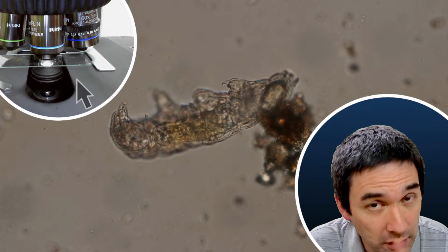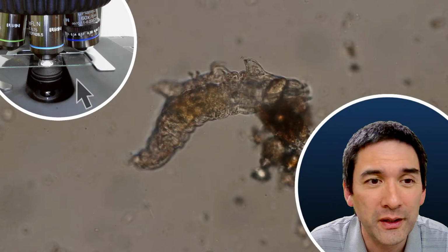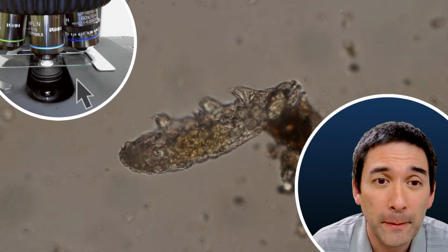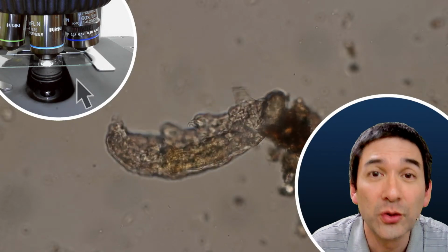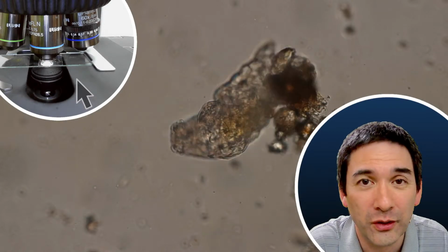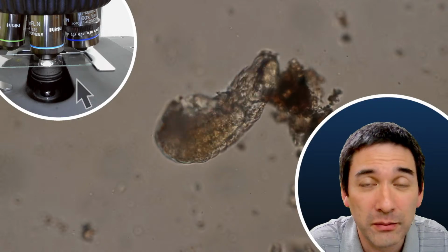I had this actually done a couple of years ago with a used Olympus microscope that was almost unusable because it was already so old and dirty. I paid 200 euros and sent it off to the certified Olympus service company. The guy was servicing microscopes for universities and so on. I gave him my microscope and said, please get it serviced.